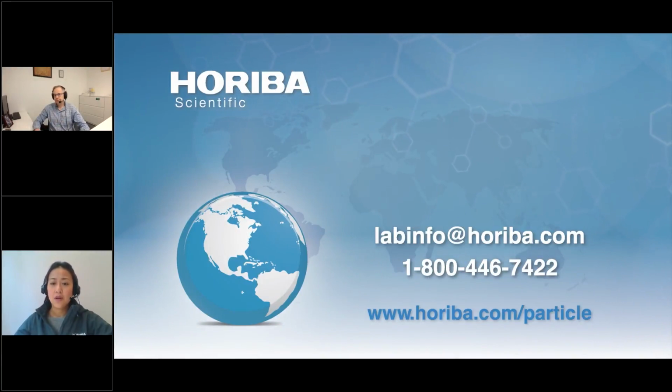Would DLS be a recommended technique to look at high concentration nucleation stage? So if you have a high concentration of a small molecule, and then you're looking at the nucleation of particle growth, then yeah, I think DLS could be used for that.